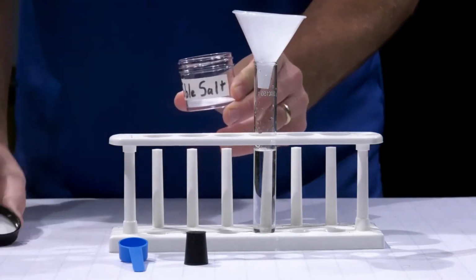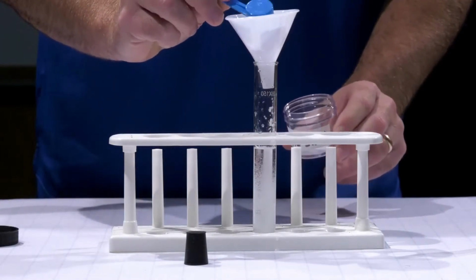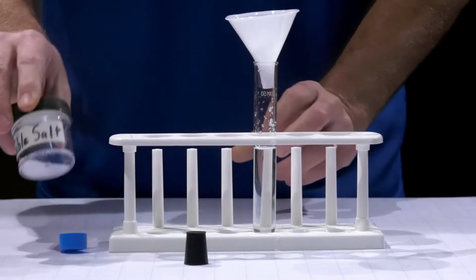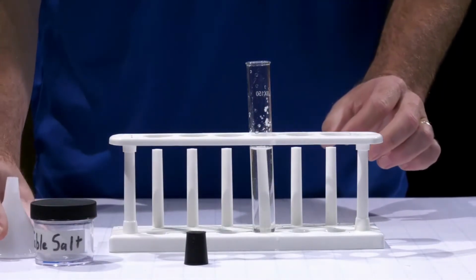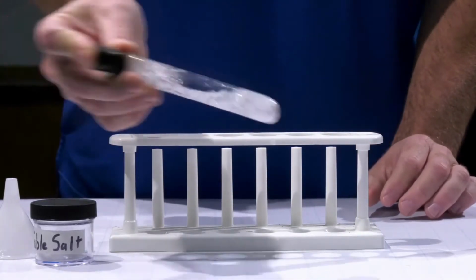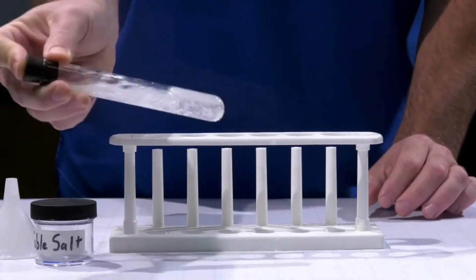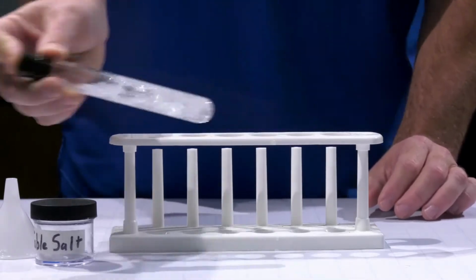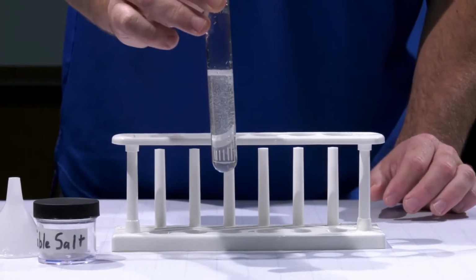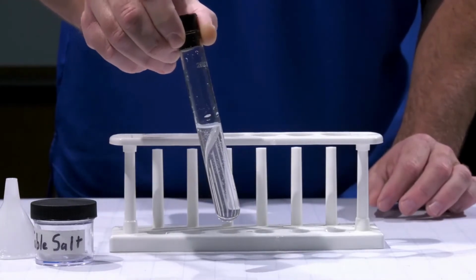But the reason why he just mixes 1 scoop for us to see is because it's just looking at how easily it dissolves. So that's what I want you guys to be watching when you watch this video. When he shakes it up, how easy does it seem like those crystals break apart? So when he gets done shaking it, make an observation or look and see whether there's any of that table salt left.